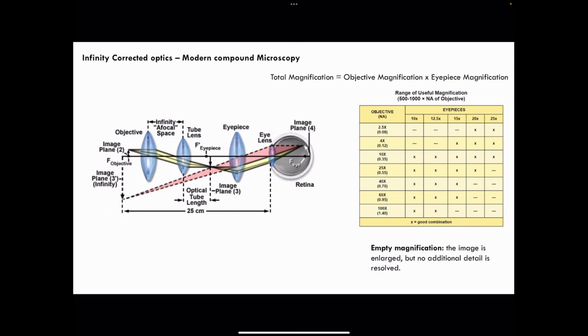Now, we also know that the total magnification of your compound microscopy setup will be determined by the magnification of all the lenses that you are using. You have an objective lens which has the greatest magnification in this case, and you also have a magnification associated with your eyepiece. Now, the total magnification is basically the product of both of these magnifications, because when your light is being visualized by your eyes, it is actually being visualized through your eyepiece, which is the lens after the objective.